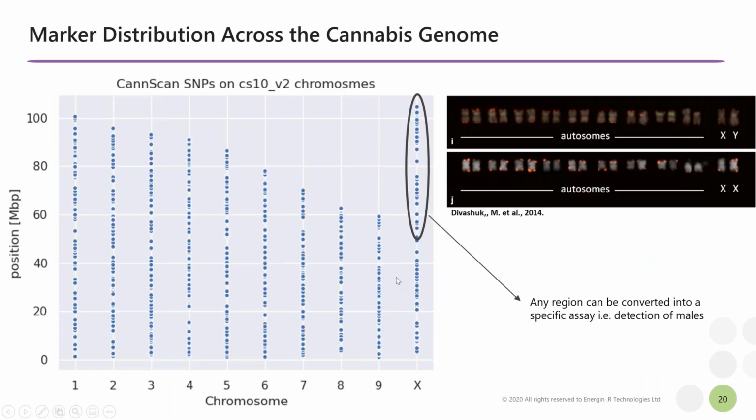This is the actual distribution on real coordinates, and the coordinates are public. These are CS10 genome coordinates. All 9 chromosomes and the X or Y chromosomes are represented evenly, with some enrichment in regions of interest. They're all represented on the entire genome, so no region is ignored.